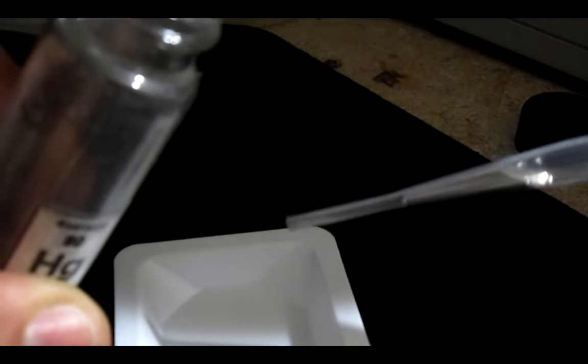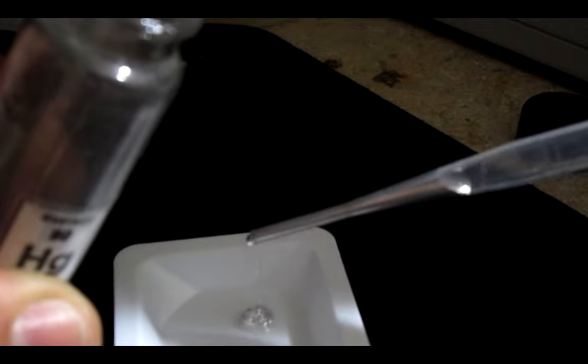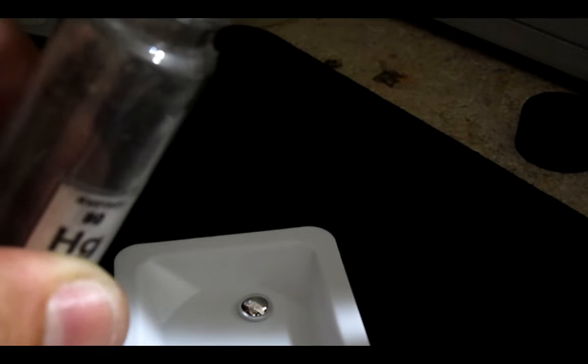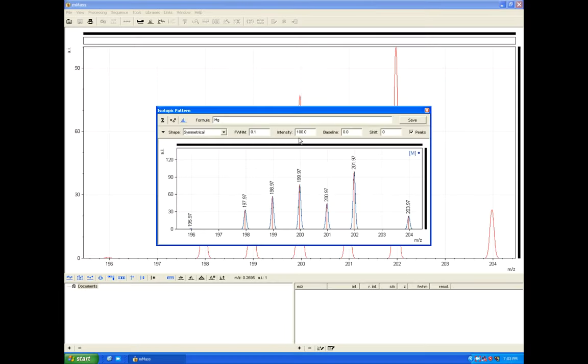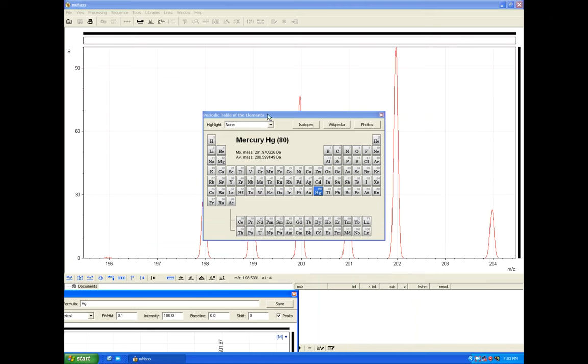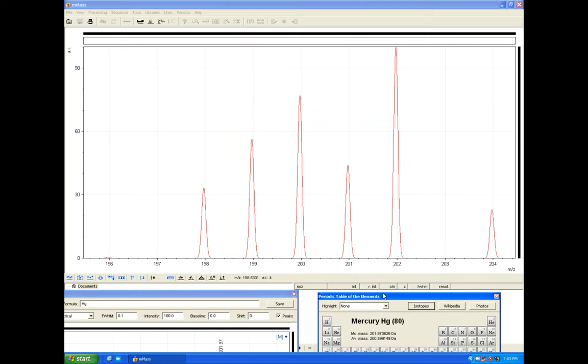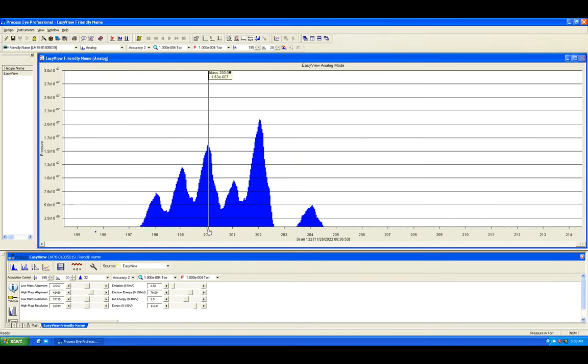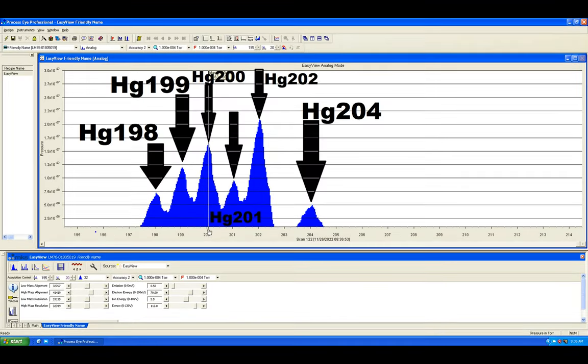To calibrate the mass scale, I introduced a small amount of mercury and looked for it from mass 196 to 204. The isotopic ratio is exactly what you would expect for natural mercury, indicating a good running instrument even at higher mass.